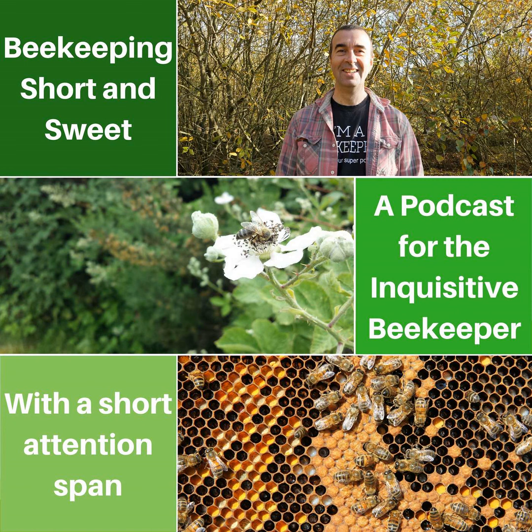Added to which, of course, the BBKA has a microscopy module in its qualifications which requires individuals to dissect bees, identify pollen and do various things. No, absolutely. And beekeepers found us all those years ago, and whilst I don't keep bees myself, I do understand why beekeepers need microscopes, and we have a range which we think suit what they have to do. Sure. And for a lot of beekeepers, they tend to focus very much on the equipment that they use for keeping their bees, their hives, their bee suits, hive tools, that kind of thing.